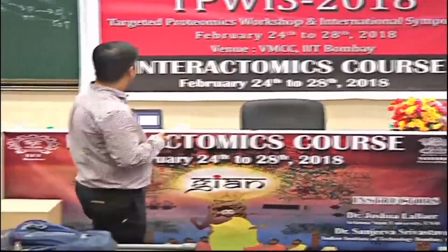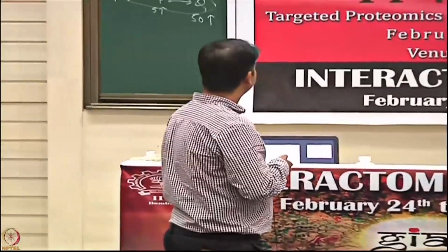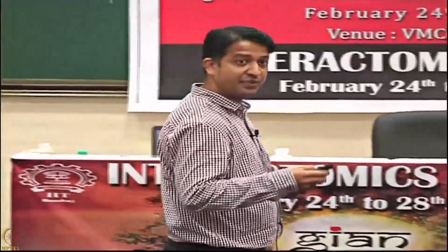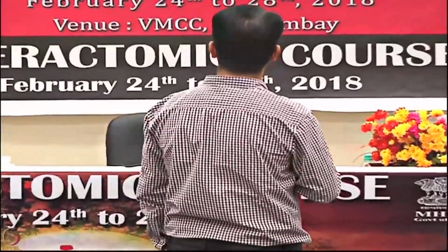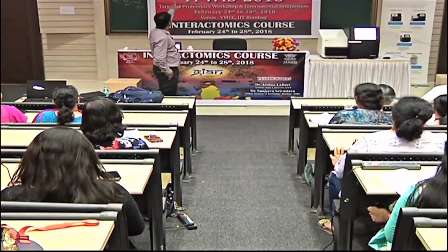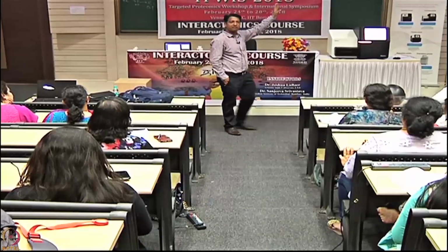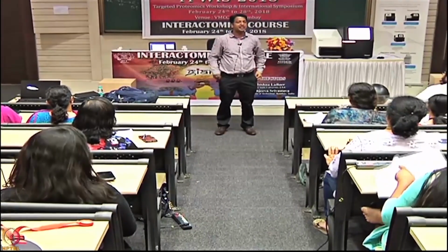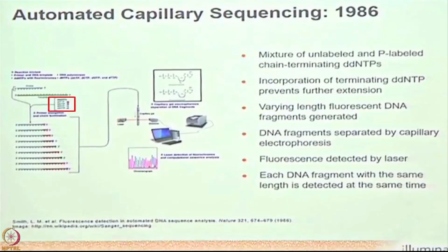That's correct. I'll start with Sanger, though we don't have a Sanger sequencer with us, just to clarify the basic things. So, this is the principle. Let's say you have a sequence; what you flow into the chamber are 4 kinds of NTPs, and one contains ddNTPs. Can you see the stretch of sequences, the labeled ones? Those are ddNTPs which are labeled with a fluorophore.